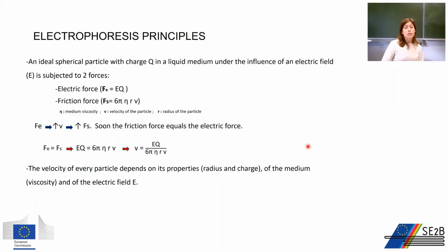Then soon the friction force will equal the electric force, and solving for v we have this equation, in which we can see that the velocity of every particle depends on its own properties, its radius and its charge, on the medium, and on the electric field.